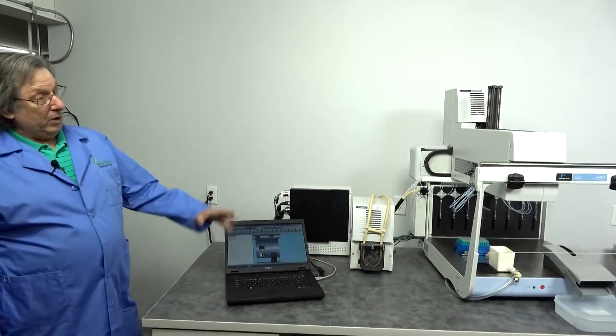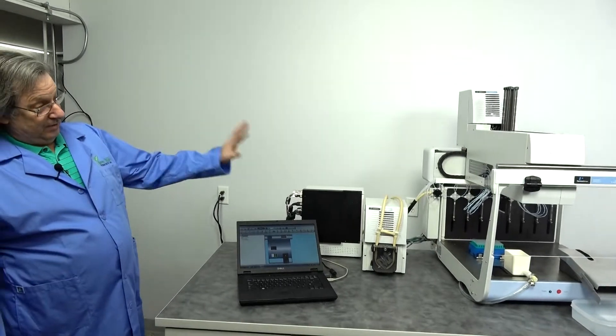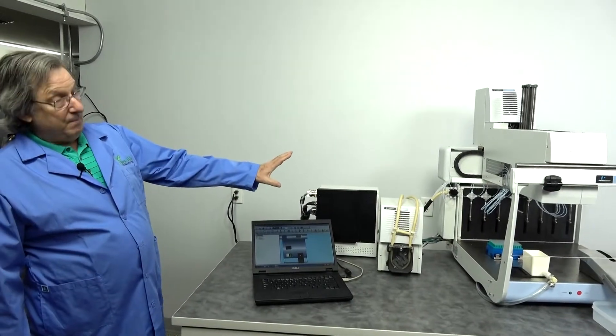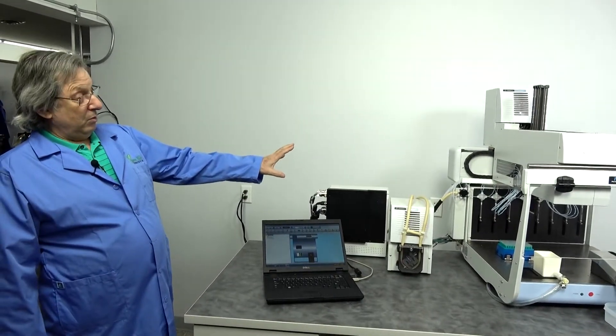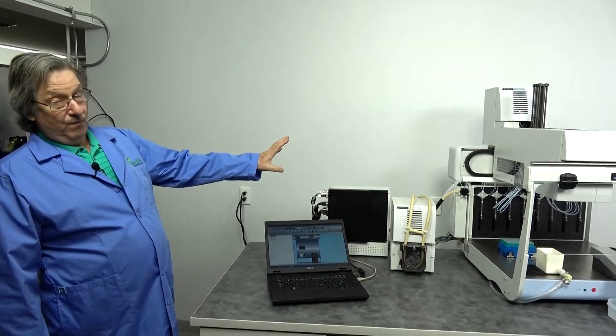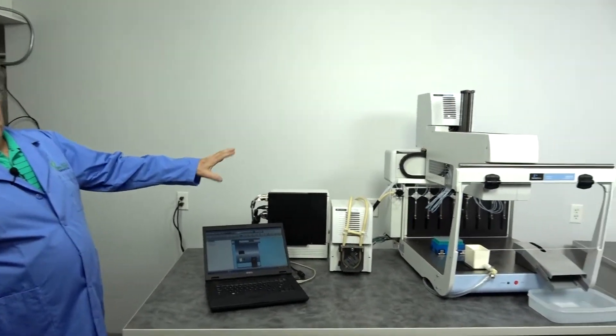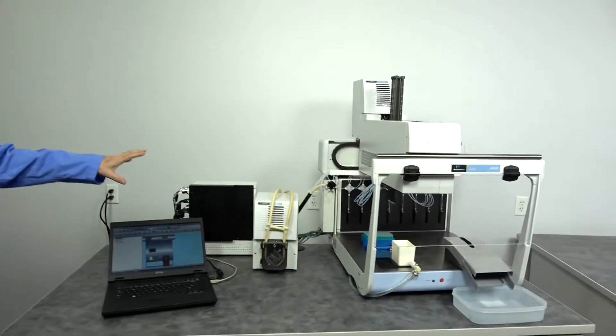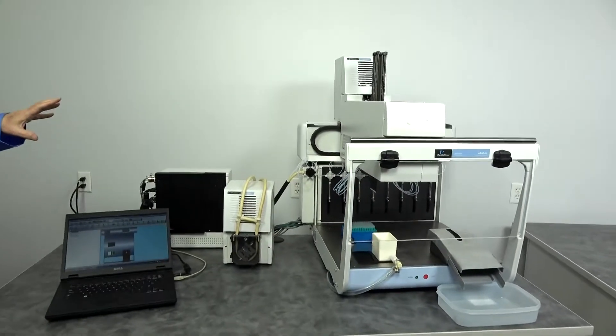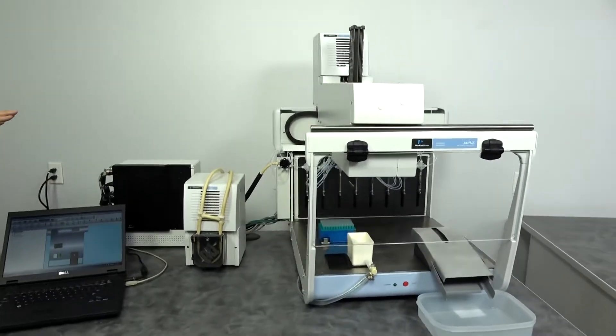The particular model we're working on is the Janus Mini with a VariaSpan 8 pipetting system.